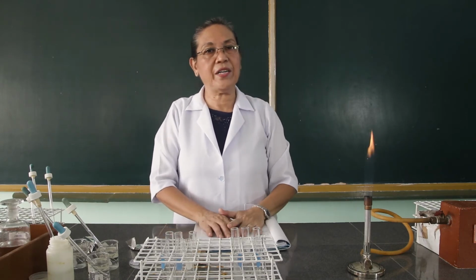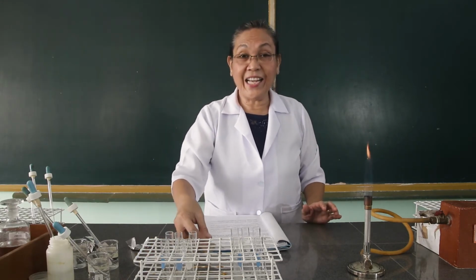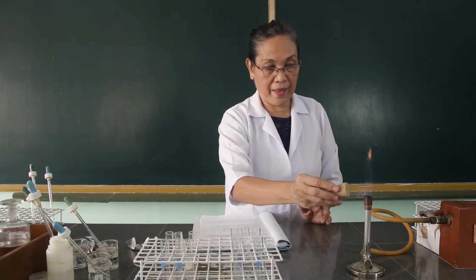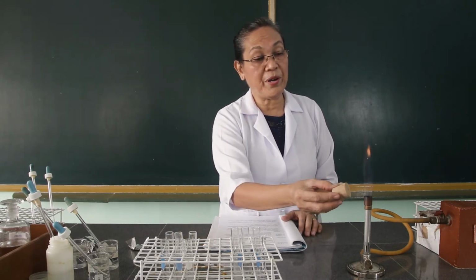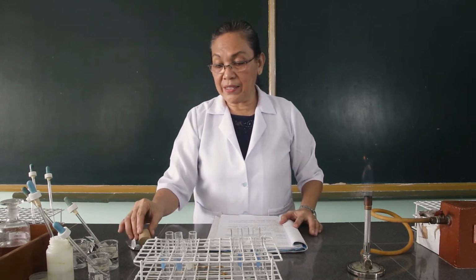Then again, we are going to have a flame test for the strontium ion. So again, we have to clean the nichrome wire to prepare it for testing the strontium ion. Since the nichrome wire is not anymore imparting a different color aside from the color of the flame, this is already ready for the flame test. Let's test the strontium ion.